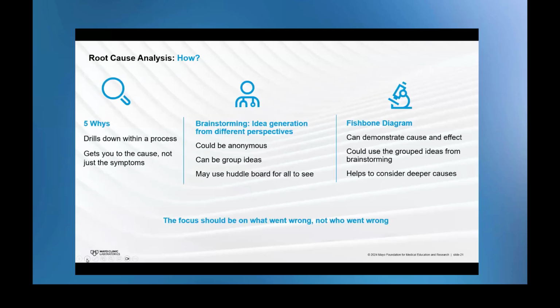So how do we do a root cause analysis? There are several ways. This is just a very short list of the ways you can go about it, and greater detail and the how-tos of it can be found in different resources that we have. There are lab-related journals, lab-related articles, and even industrial literature. But at a very high level, just as an overview, the 5 whys is one I use often when we talk about employee safety incidents, especially where the event seems pretty straightforward and maybe procedural driven.